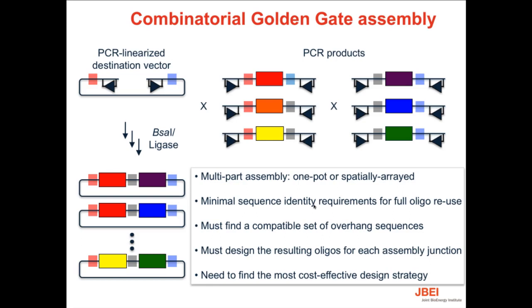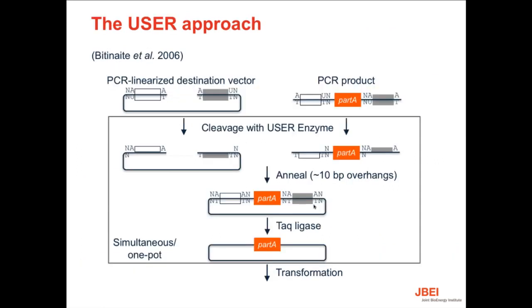And again, just as background context, in which we can frame a discussion around the flanking homology methods, this is just another type of related approach, the USER approach. And here you essentially do need to do some type of PCR reaction or do DNA synthesis that's enabled by having uracil base pairs.